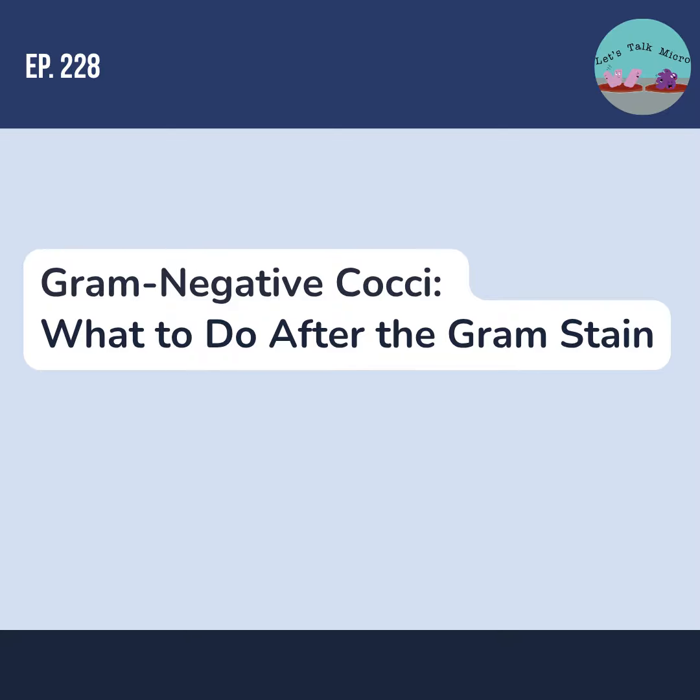You're giving that organism the plate, the media that it needs, the conditions like CO2, and at least you give it a chance. And if you work in a lab, there's no question that Neisseria gonorrhoeae needs CO2, especially those of you that do quality control. And sometimes your monthly bugs or some things like that, you subculture them to blood agar. And once they grow, you put them in the fridge.